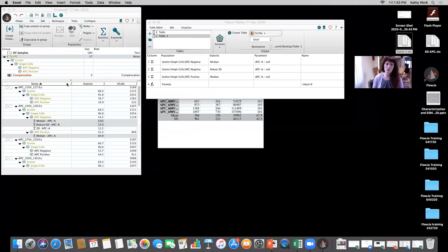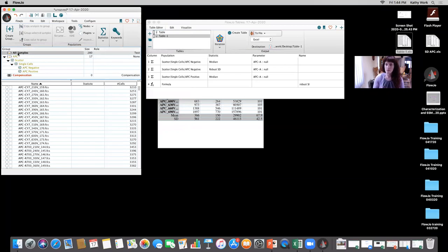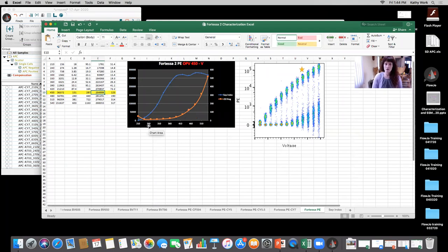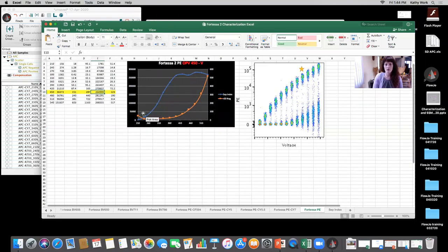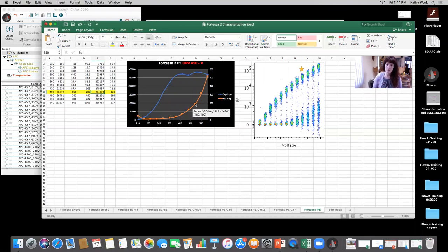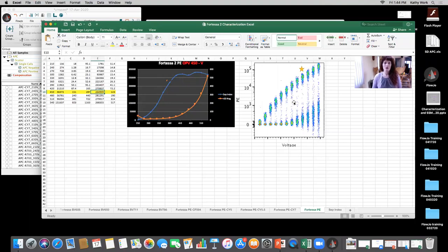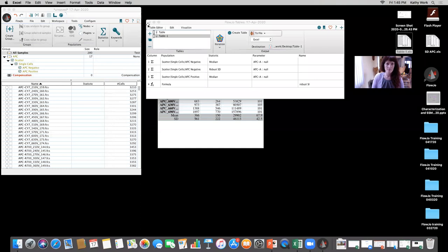For sake of time, I can open up a characterization that a member of our facility, Joanna, did very beautifully — taking a look at these calculations for all detectors across all instruments. You'll see we also plotted the RSD of the negative. We have stain index or separation index data across all different detectors. The next thing I'm going to show you is how we can concatenate that data from that detector into one file to get a nice visualization.